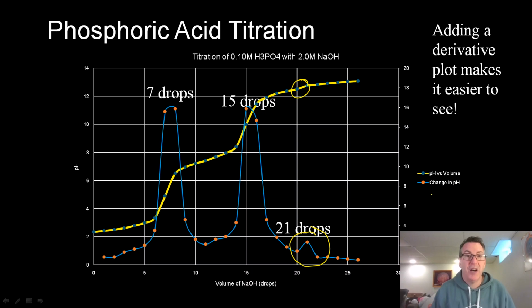Again, I was really excited when I saw this titration curve there. So kind of neat to see, you know, not everything has to be brand new or groundbreaking, but it's stuff I hadn't seen, at least on the internet before. And most everybody just says, oh, you only see two. Well, you can see the third one. It's just really difficult to get it this way.